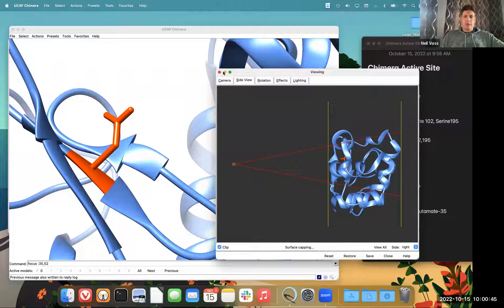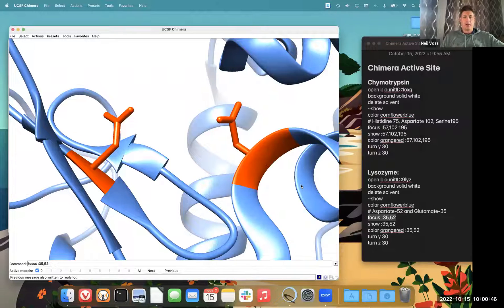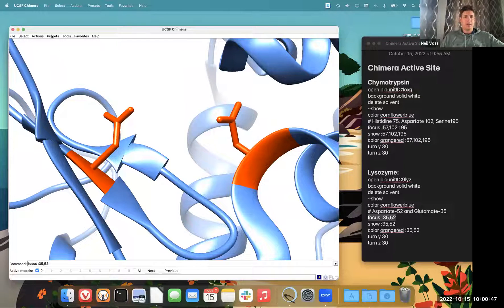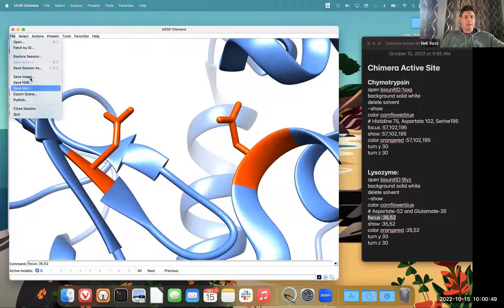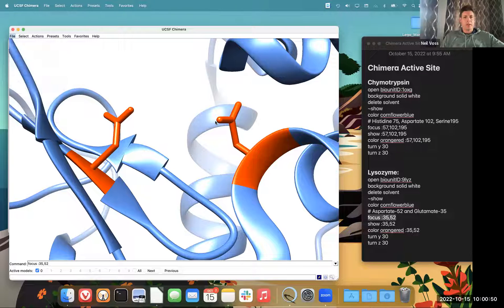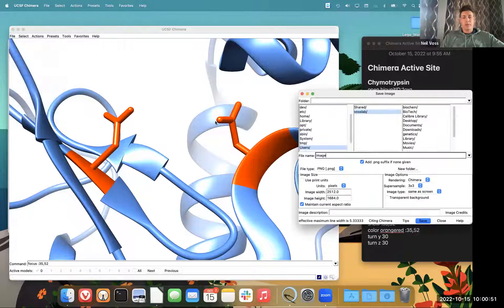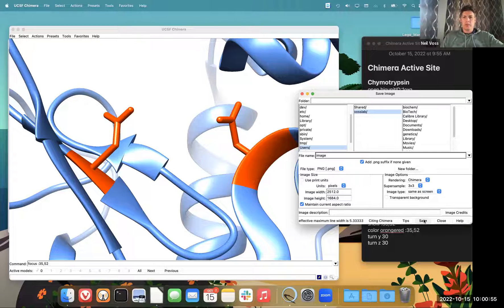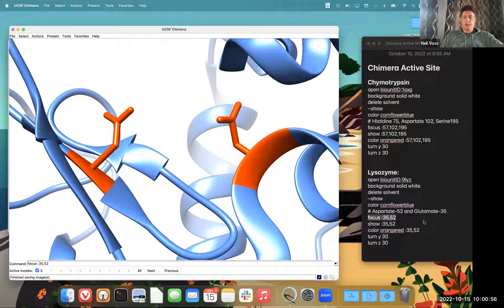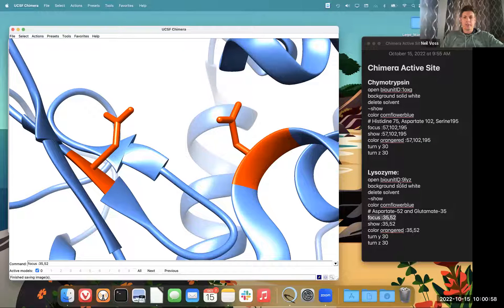So that is how I created the image of the active site for lysozyme. Now, if you want to try and do it for your protein, you should have good success. I have all the commands I used off to the right.